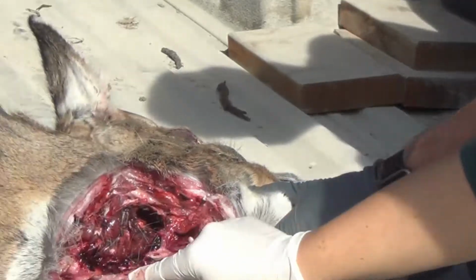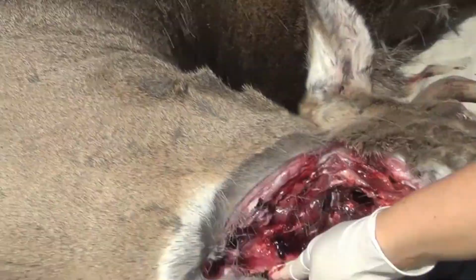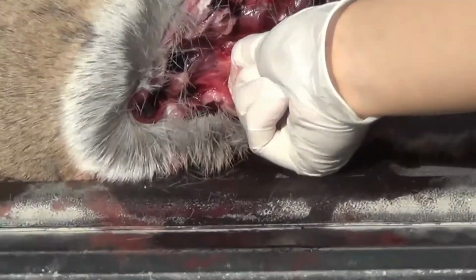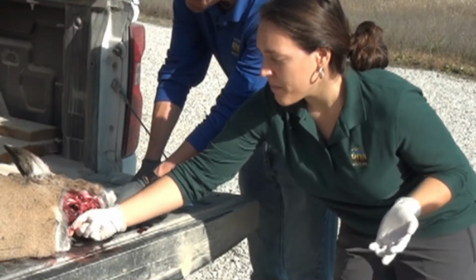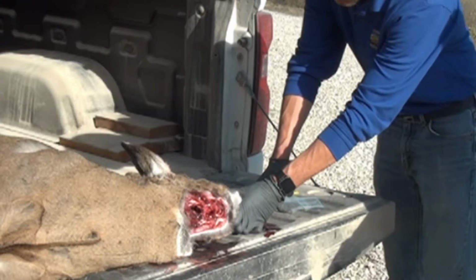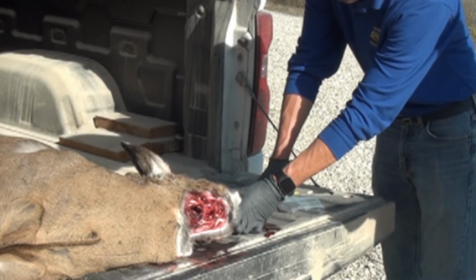So there's kind of a fluffy tissue right over here, if you can kind of zoom in on that. A lot of people get confused that this is the lymphoid tissue or the retropharyngeal lymph node. That's actually the salivary gland, and it kind of looks like a fluffy, cloud-like structure.